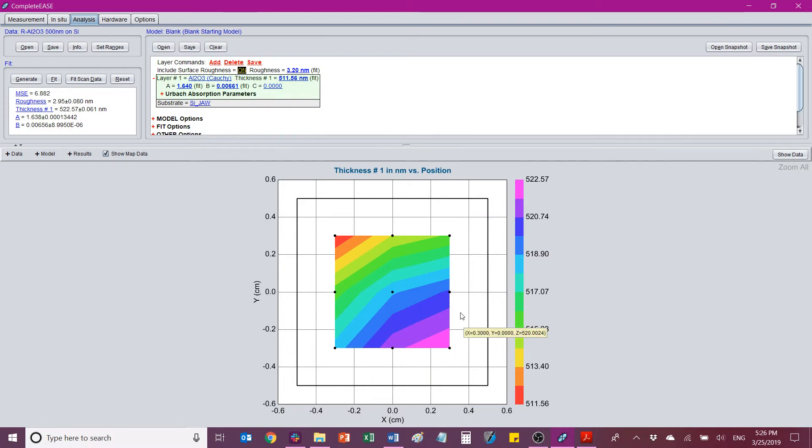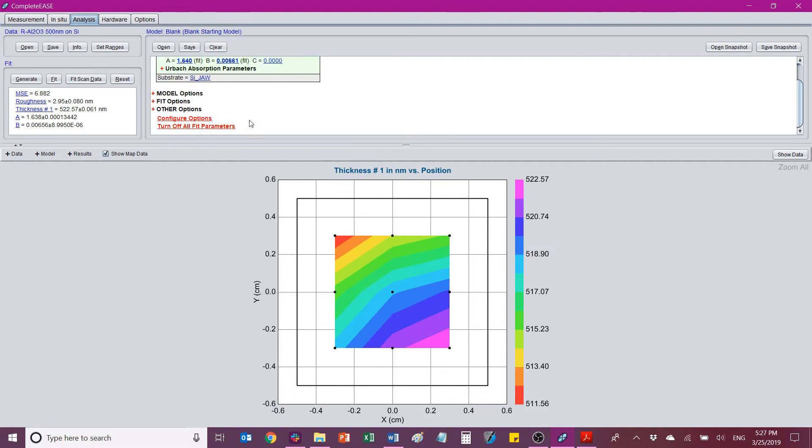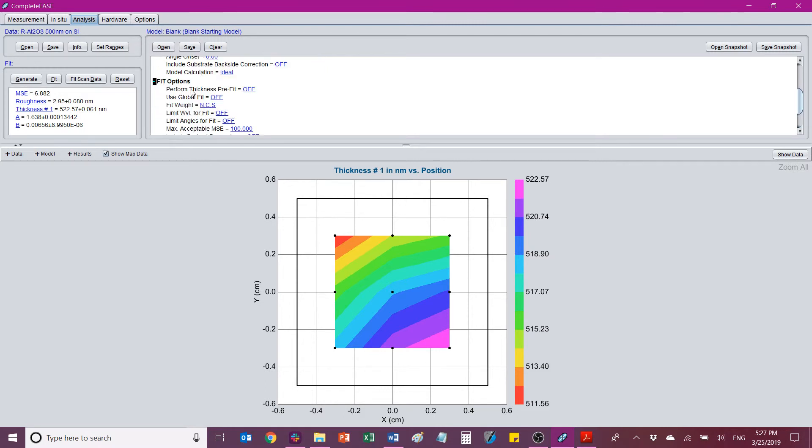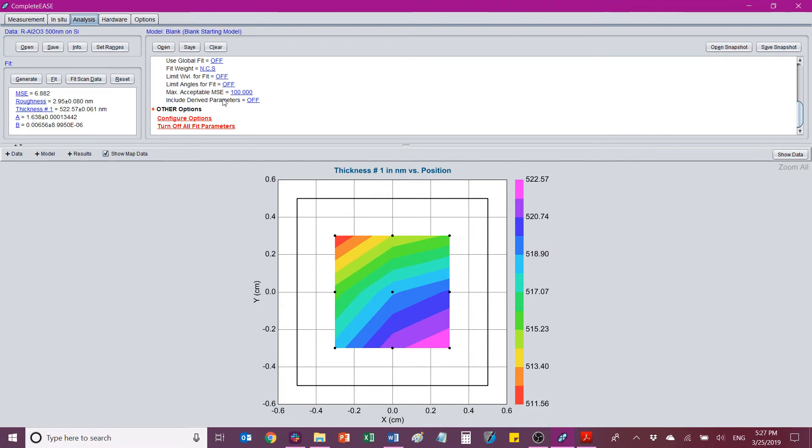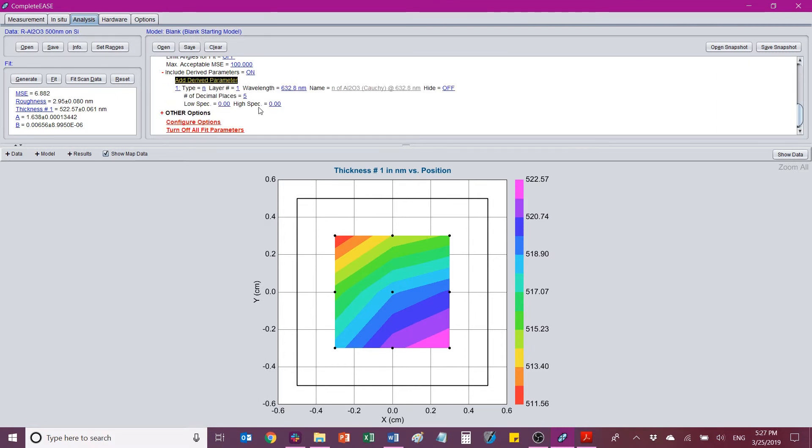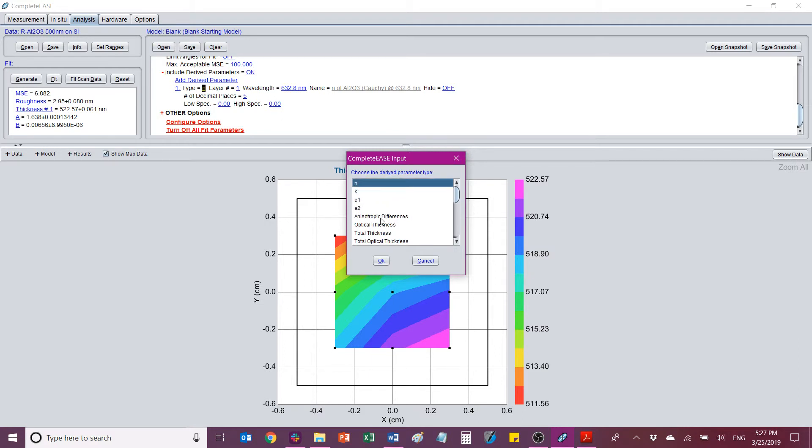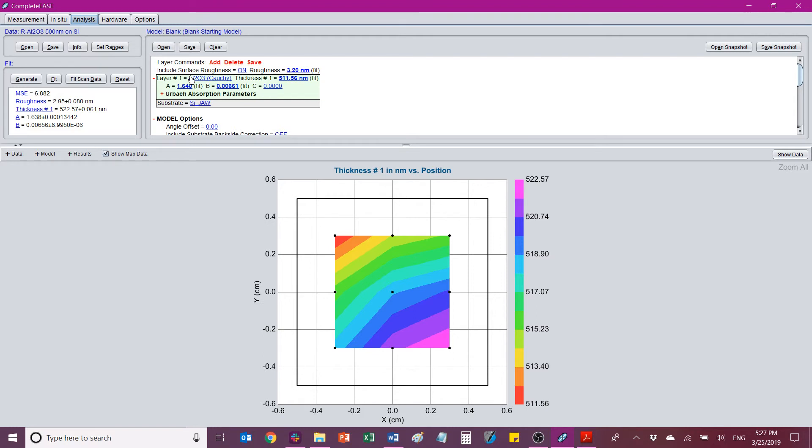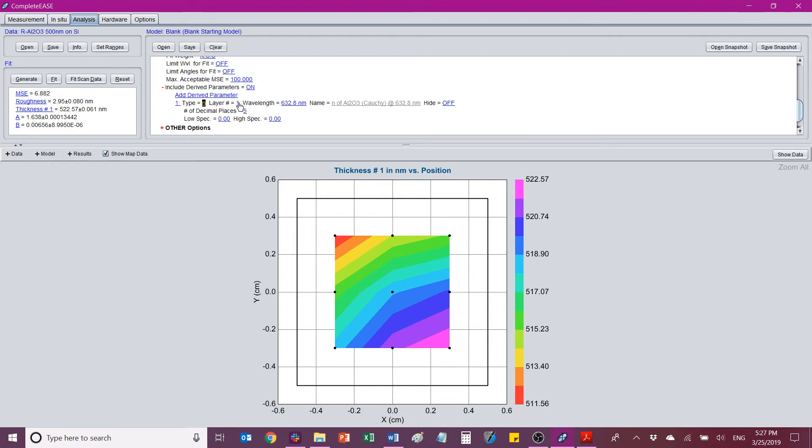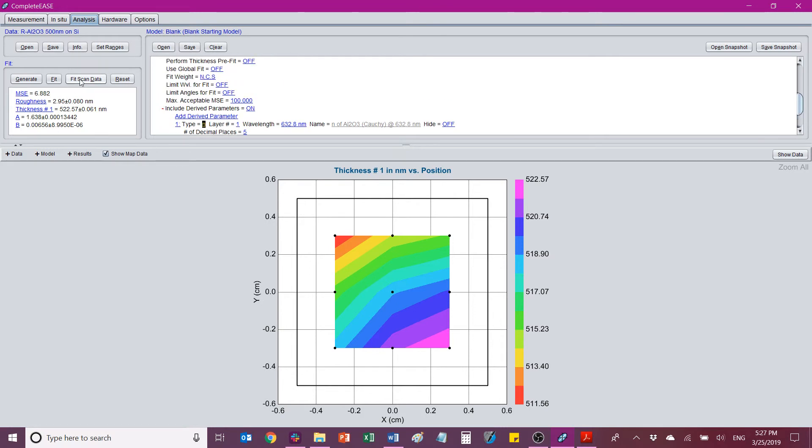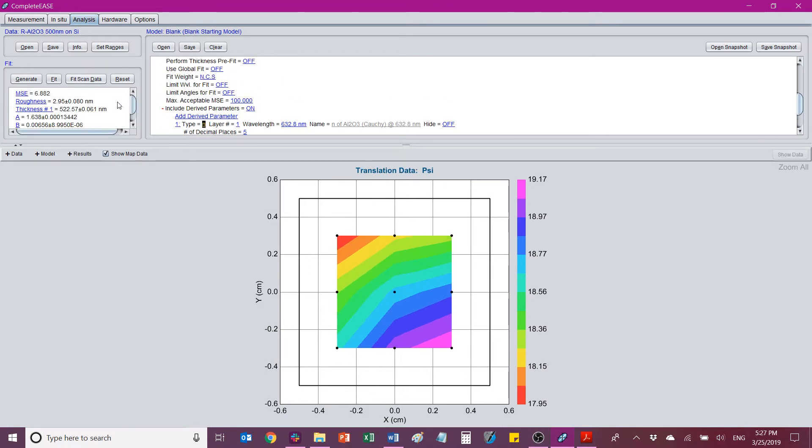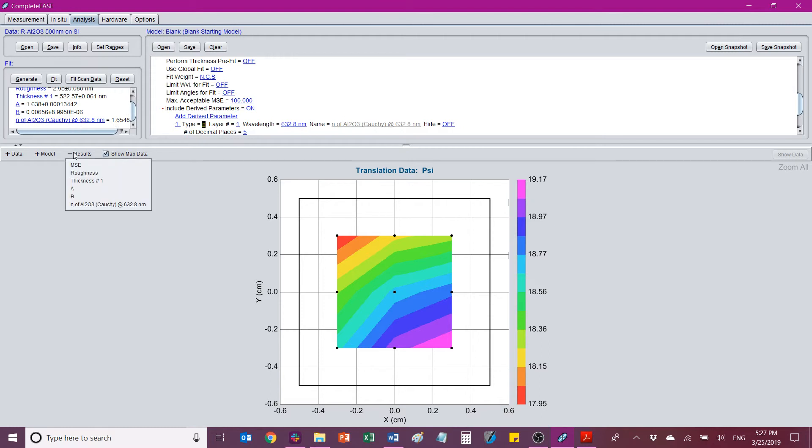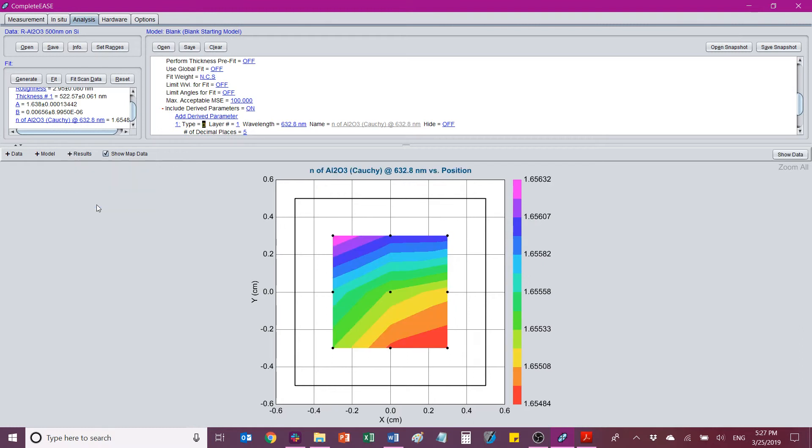We'd like to get a graph like this that shows us the index of refraction. So I can add that to what's being reported. And it is located, here it is, in fit options. You can go to include derived parameters. Now on, and I can add a derived parameter. So what I'll do is I can change the type. I'll choose this as all the different types I can choose. So I'll choose N for index of refraction. For layer number 1, at this wavelength, this will be the name of it. And I'm not going to hide it. So now that that's there, I'm going to go ahead and do fit scan data one more time. And now I have this as a fit parameter that gets spit out. Now if I go to results, I'll have this as an option. And I can choose it. And now I'm looking at the index of refraction over the surface.